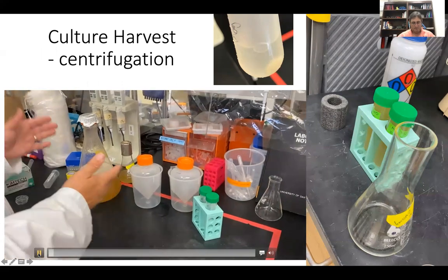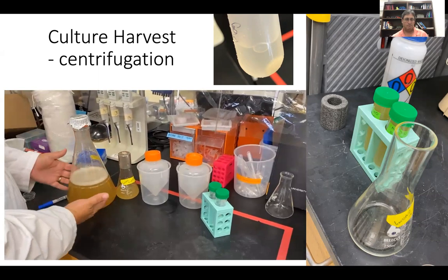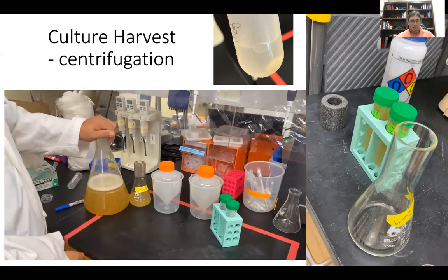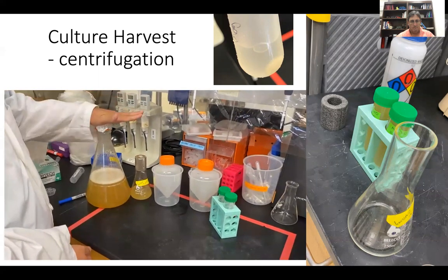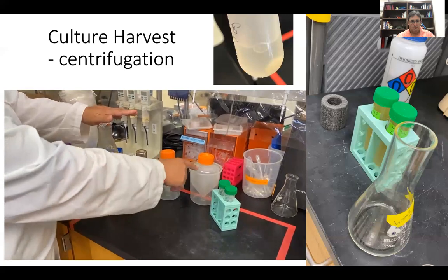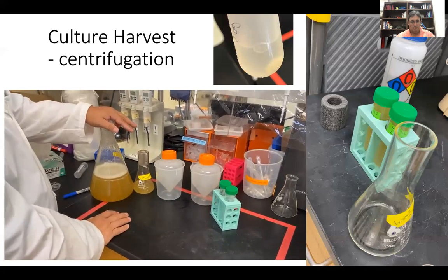All right, so we've cultured these overnight at 20 degrees. You can see a nice thick, dense culture. We have both our 100 mil culture and our 1.5 liter culture. Everything is going really well. So now we're going to take the 1.5 liter culture and split that into these two 500 mil vials and centrifuge them down.